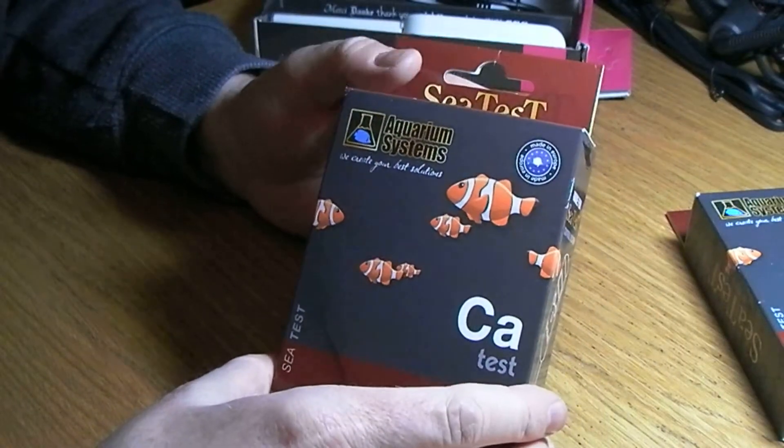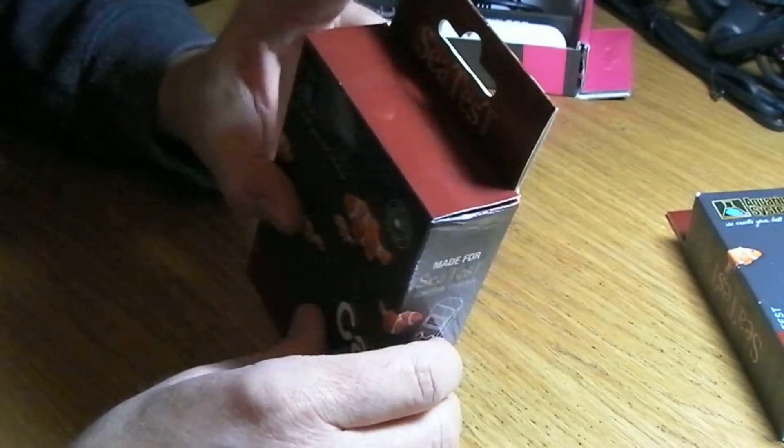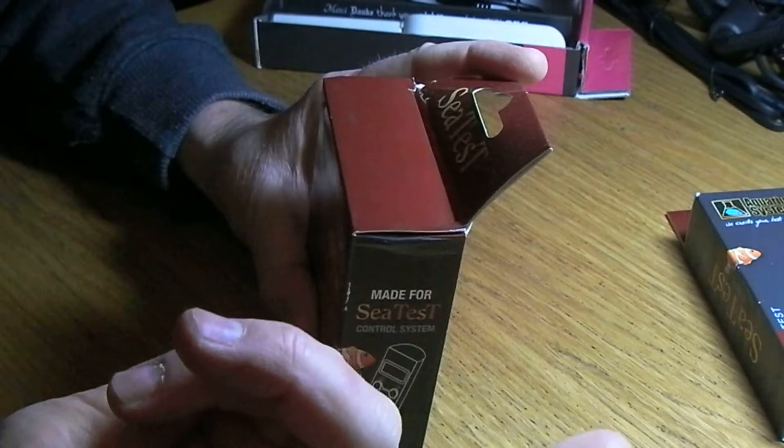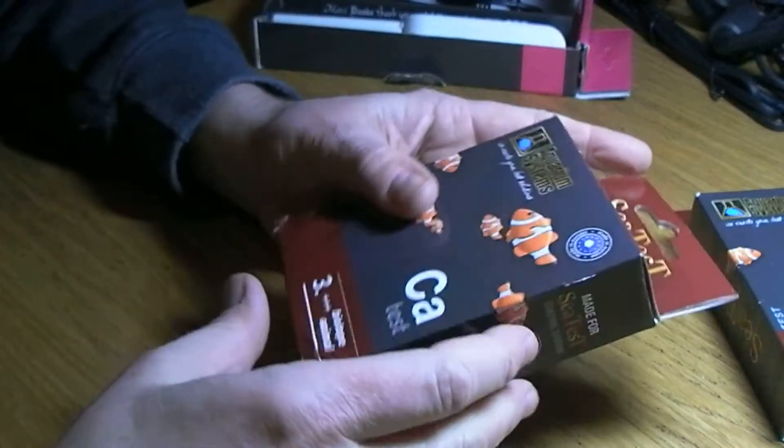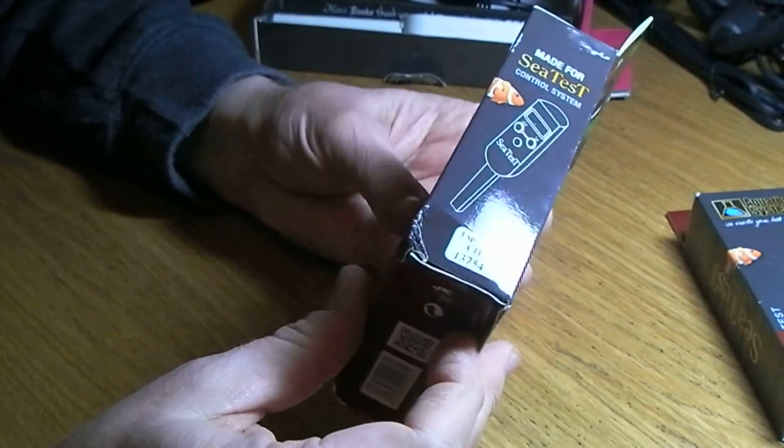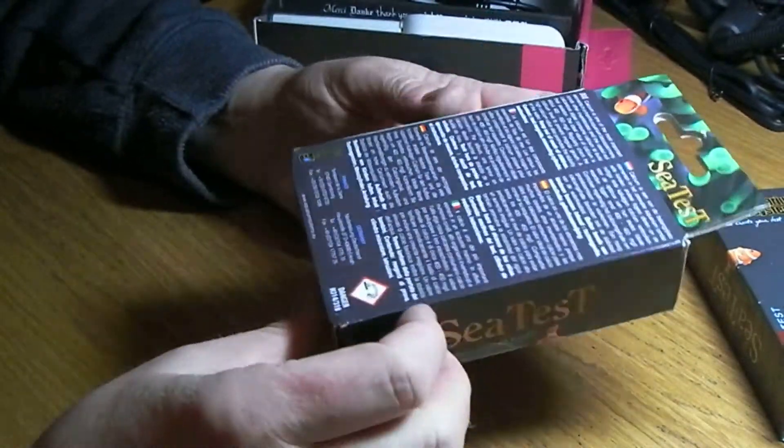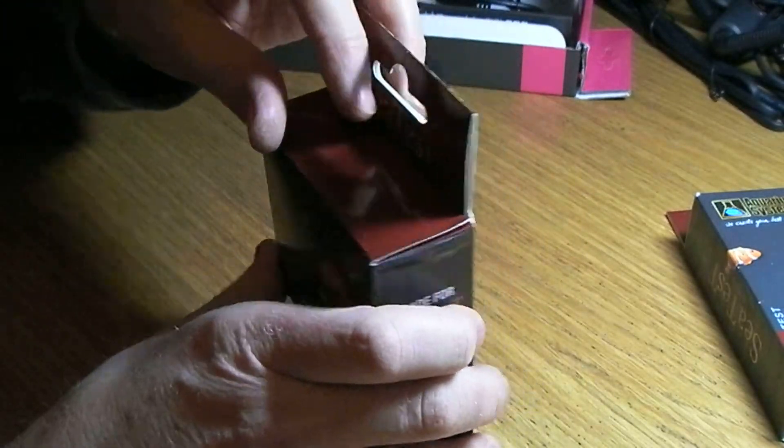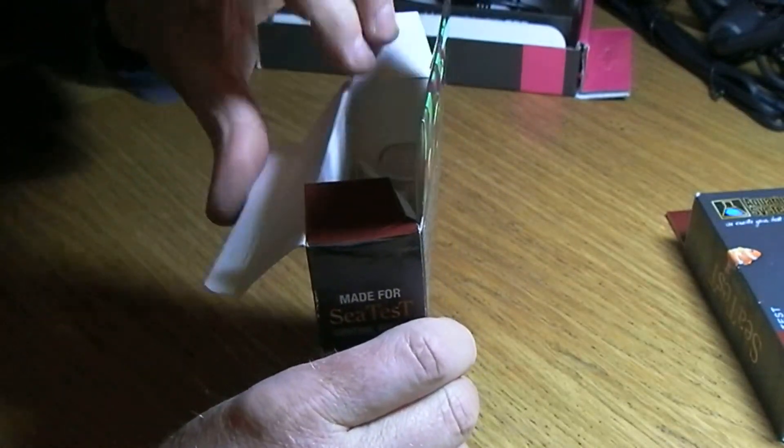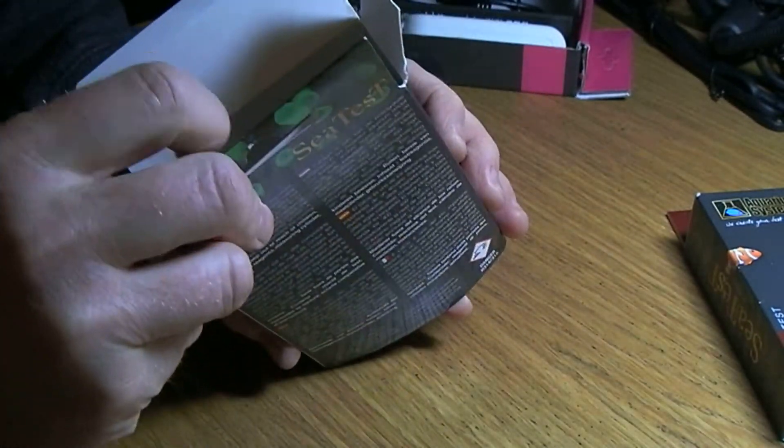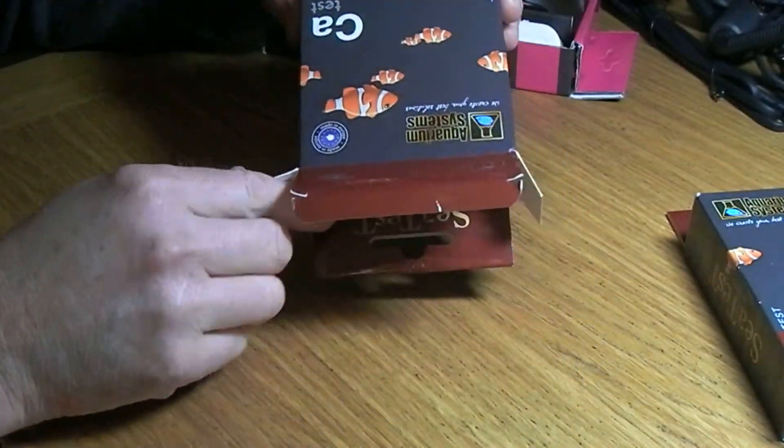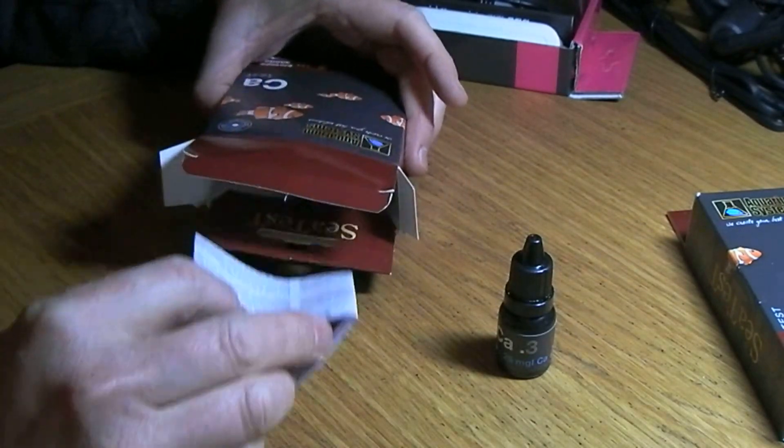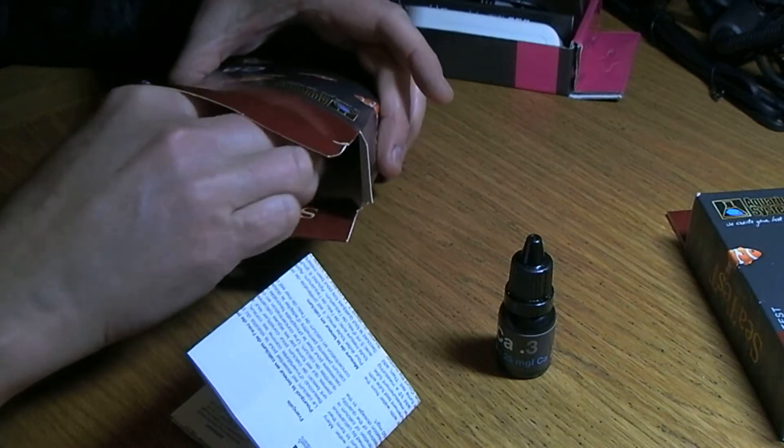That's a quick look at that. So we'll just have a quick look at both of the test kits I bought - calcium and magnesium. The top of this is covered in dust. It's got a bit battered in the post. I have to say I think the packaging is going to need to be taped up. I like to actually keep my test kits in the boxes they came in, but I think without a bit of tape on this one it's not going to last very long at all.